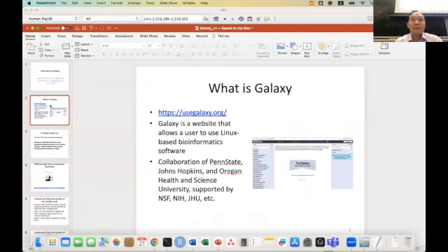If you sequence a new organism, you can create the new reference genome. You can upload it here, along with your own data, and by sequencing another organism, you can compare here. So basically, IGV is this kind of a tool. You can compare any sequence-related information. You can upload your own genome, any interval or any other file, and see that in the context of the reference genome.